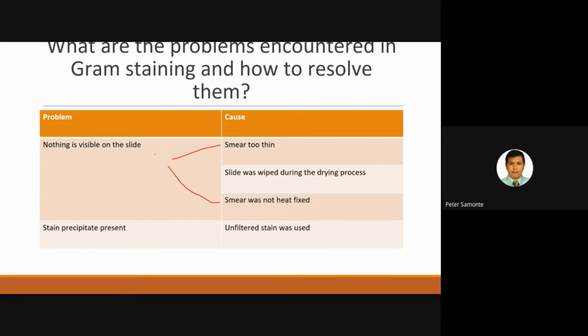Yes, sir. Matry lang po, sir. After the air drying of the sample, sir. Okay, very good. So you would do this after air drying. Now, in your practice in the future, class, there will be times when you're having too many specimens and you would tend to forget to heat fix. And when you do not heat fix, class, we have the so-called washing out.